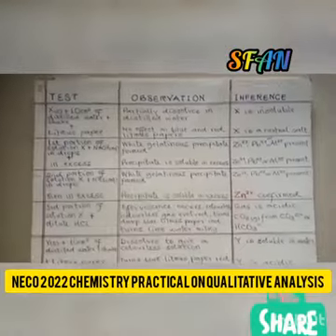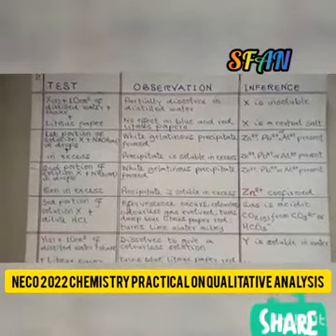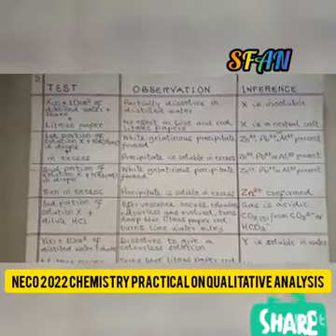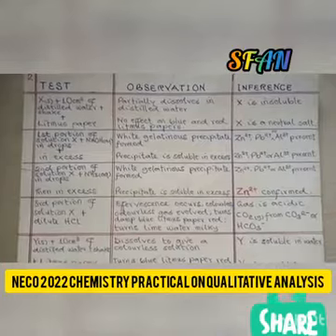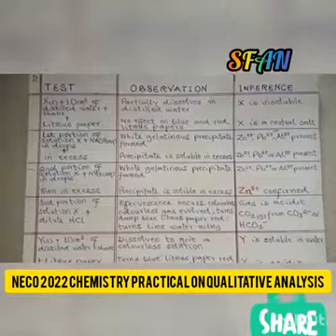We have test, observation, and inference. Say X in the solid state plus 10 cm³ of distilled water, plus shake, plus litmus paper.